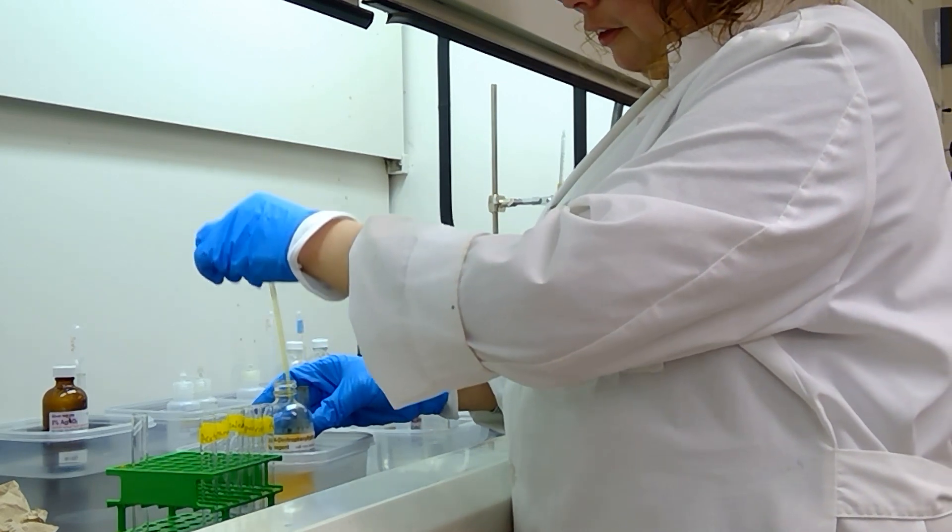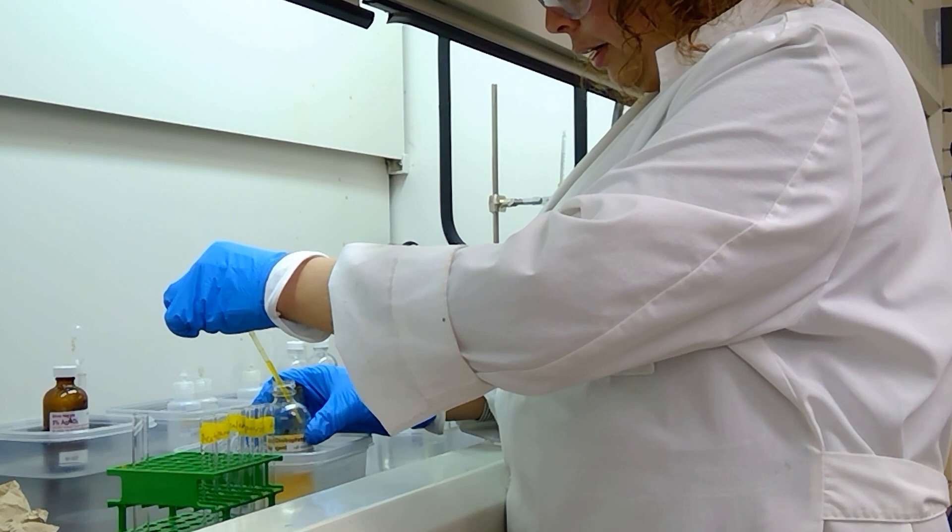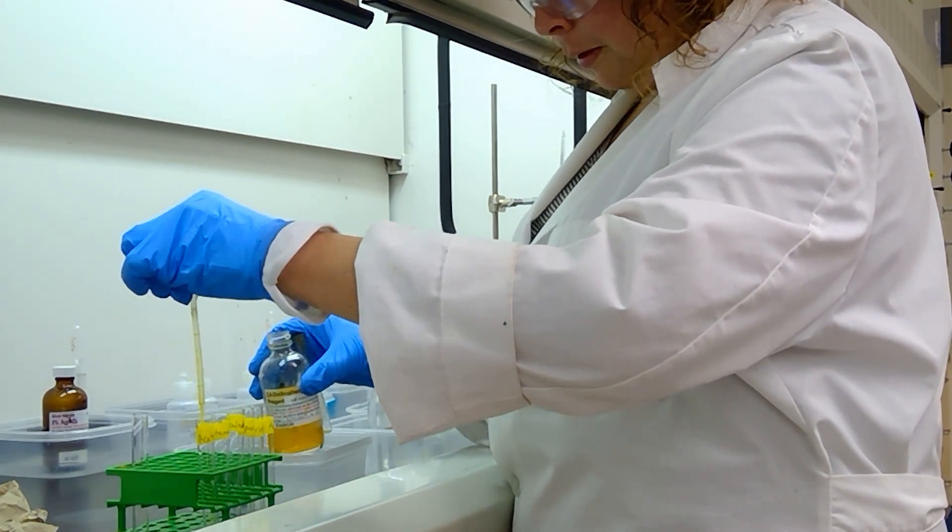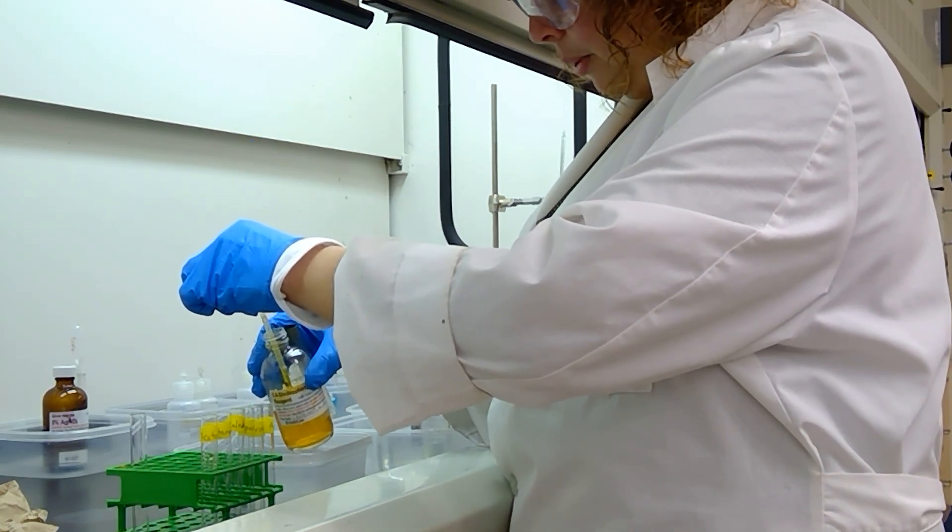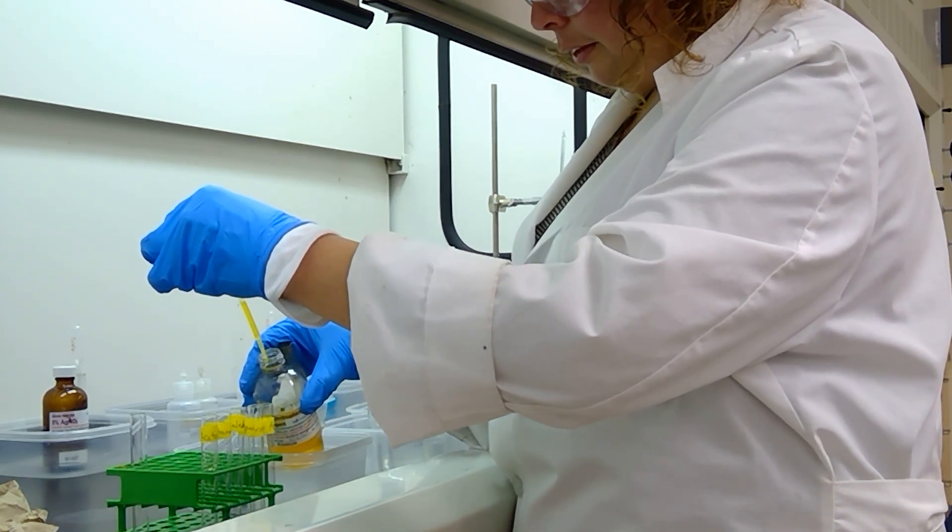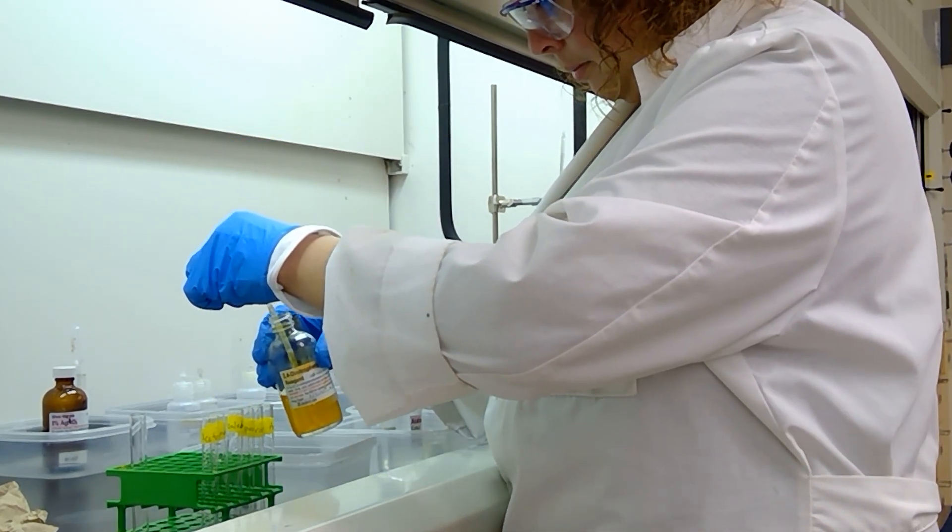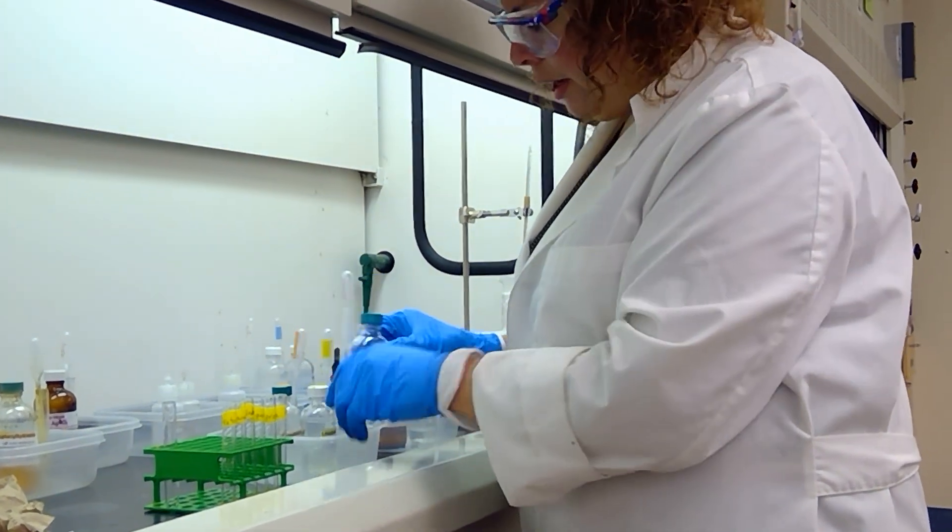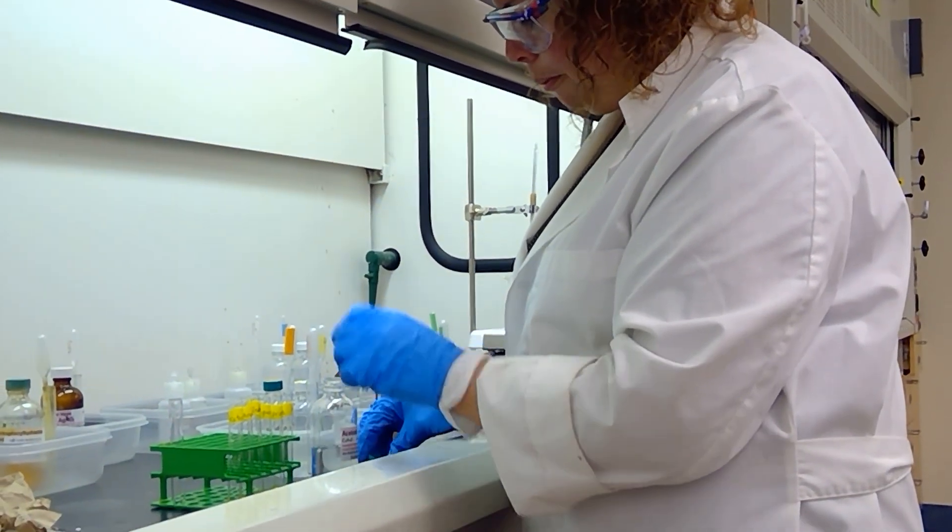We're starting this experiment by measuring out half a milliliter of 2,4-dinitrophenylhydrazine solution into each of our test tubes. We're doing the same six compounds that we did in the bisulfite test. So we have measured out our 2,4-dinitrophenylhydrazine into each of the samples.